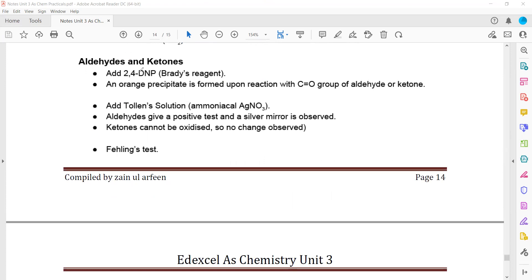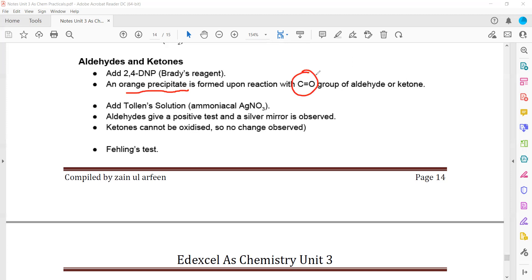To test for aldehyde or ketone, we add 2,4-dinitrophenylhydrazine (2,4-DNP), also known as Brady's reagent. Both aldehyde and ketone give an orange precipitate with Brady's reagent. A positive result indicates a carbonyl group (C=O), which is present in both aldehydes and ketones, so this test does not distinguish between them.